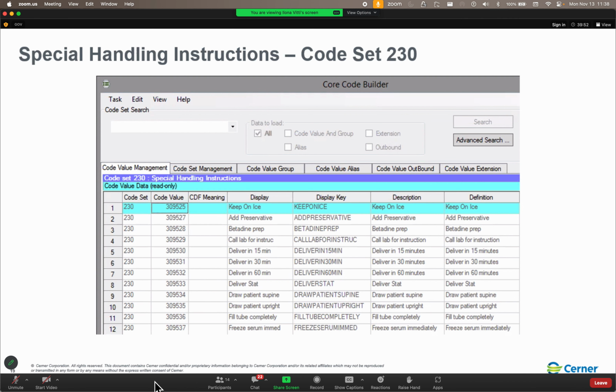Now in here, we've got 3 modes: requirements only, requirements and aliquots, or we can even search for orders where no requirements have been defined yet. Probably should be an empty list in your production domain. If not, I've got questions. Now for the activity type for this activity, we're going to go to lab, for the activity subtype, chemistry, and click retrieve.